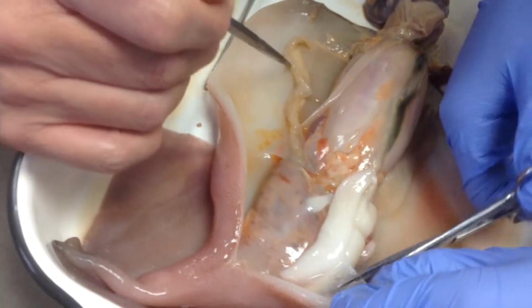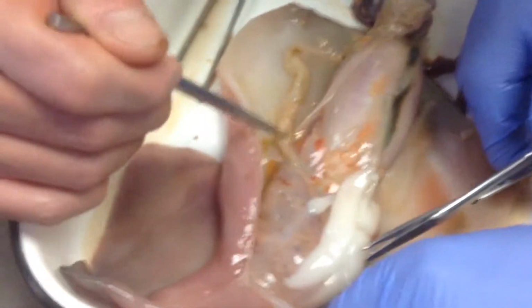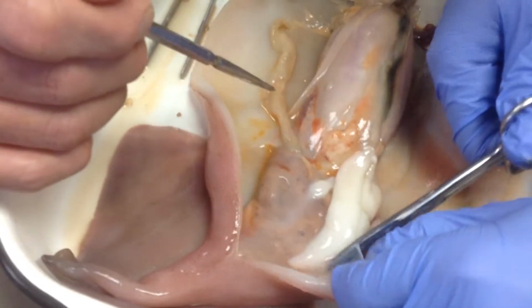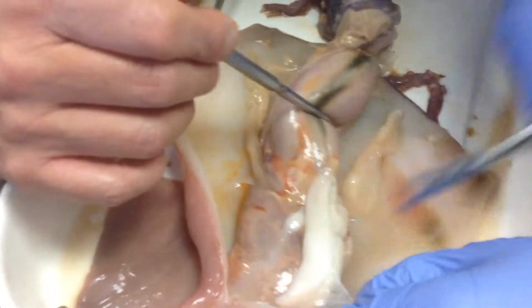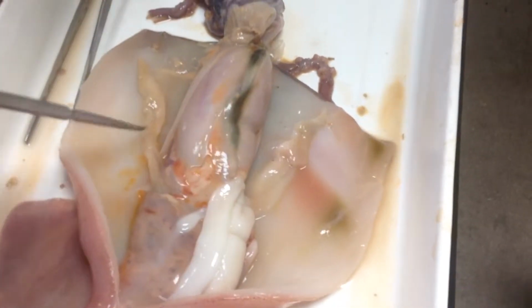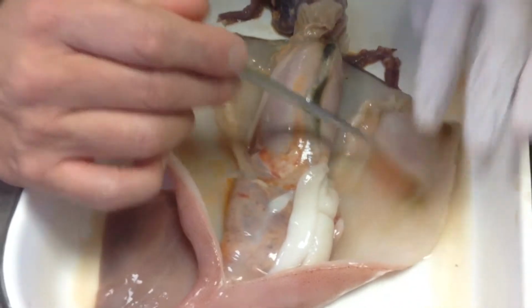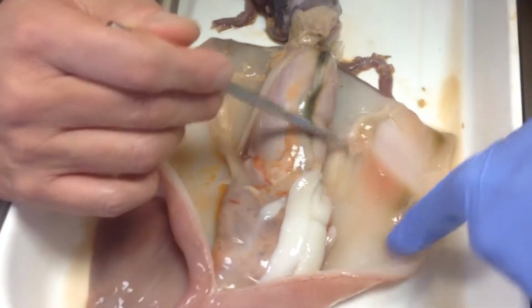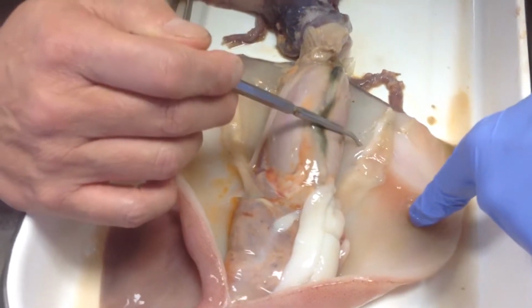Oh my God! Look at this. This is something different from that. It's definitely this film. I bet you, if it's bilaterally symmetrical, I've got to guess this is on the other side too. Oh! He has two of them. Look! He has one here that's kind of feather-like, and one here that's kind of feather-like. What about this discoloring here? I don't know about that, but these things here possibly look like they're frilled to extend surface area.